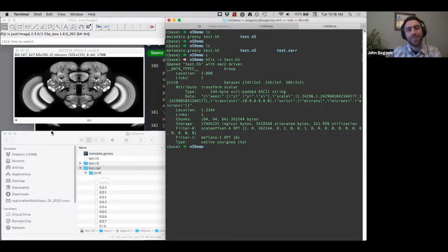If it's of interest, we can talk about that later because we can talk about that for a long time. And Christian knows that there have been a lot of conversations about this, and the community is working towards a standard, and I'm very excited about that standard becoming more widely adopted.